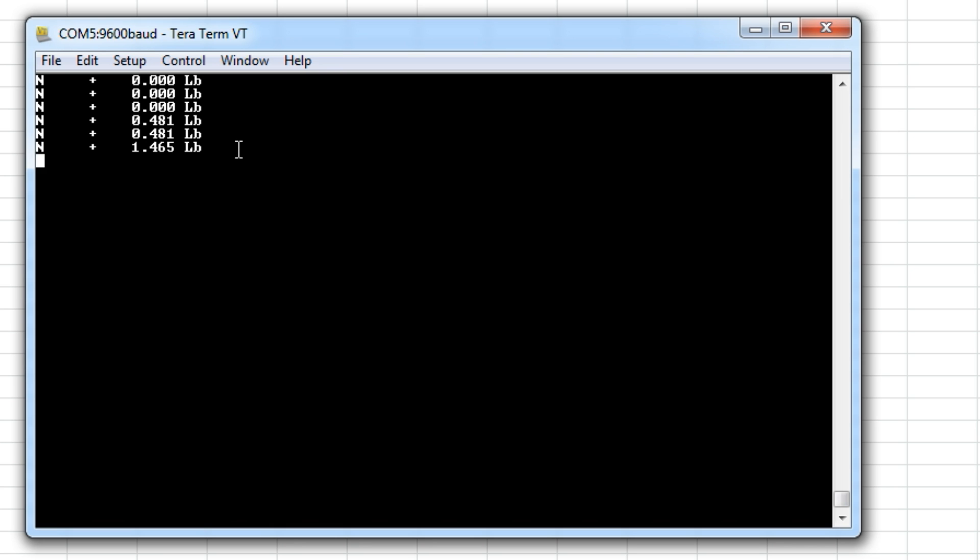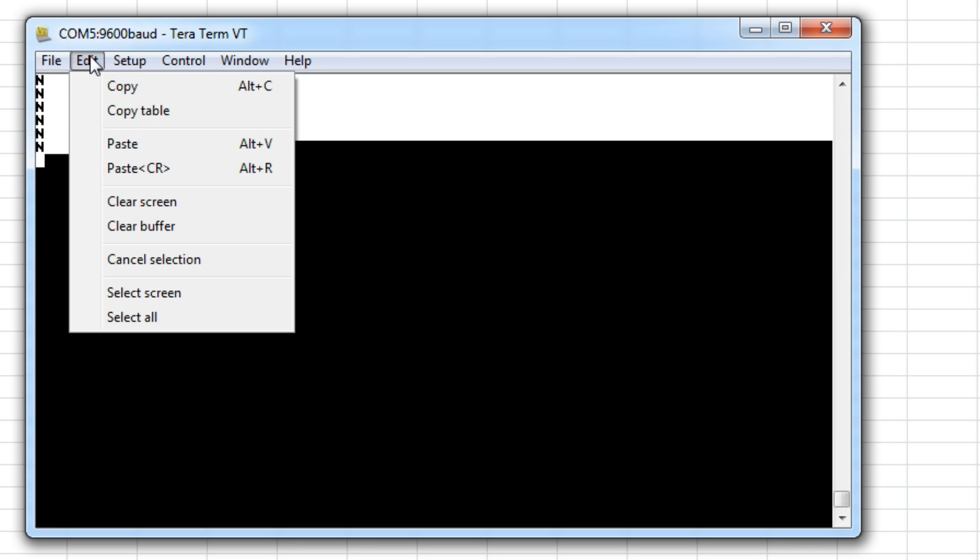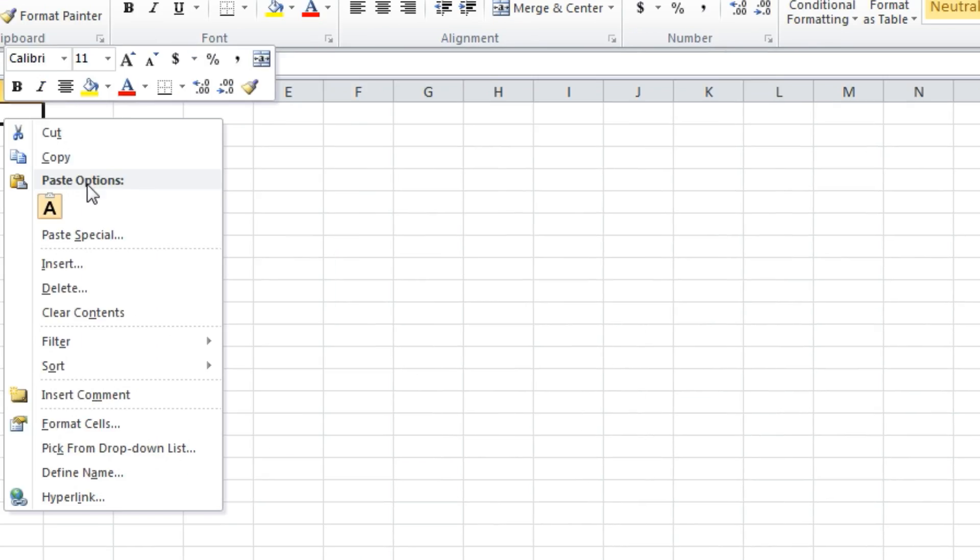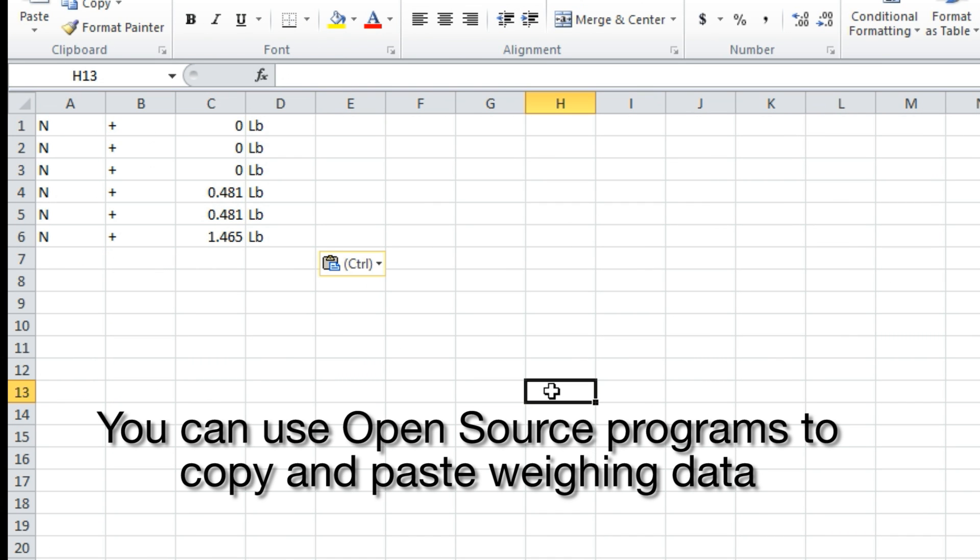If you are satisfied with transferring your weighing data to your computer in plain unformatted text for you to manually copy and paste, there are open source programs that allow this.